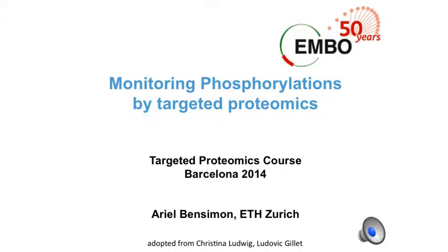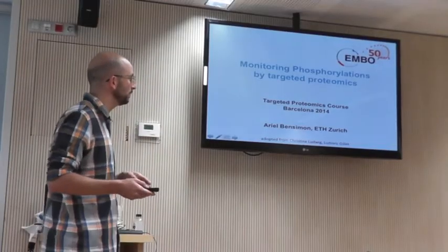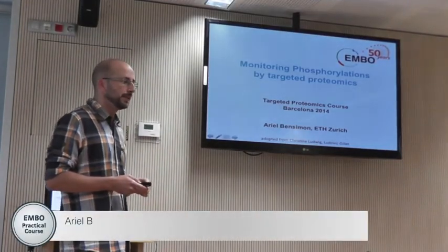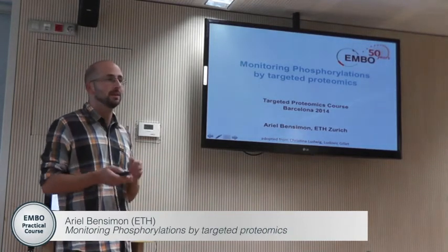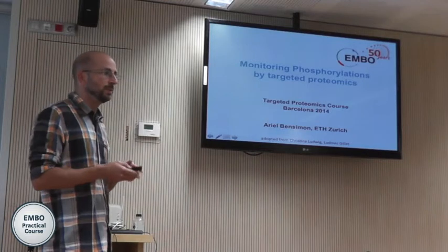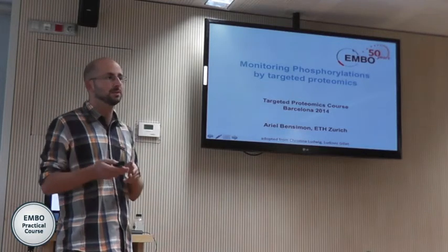So we heard a bit this morning about doing data-independent acquisition, and my talk is going to be about monitoring phosphorylations by targeted proteomics. I'm going to talk both a bit about SRM and SWATH type of data, but I will always try to keep it general enough to be applicable to both. And this is because some things that we do in phosphorylations or any type of other modification are a bit different when we look at specific peptides versus when we look at proteins.